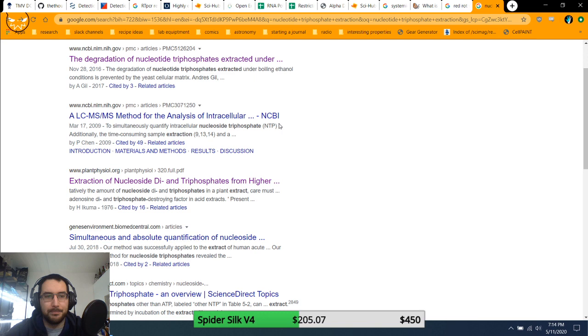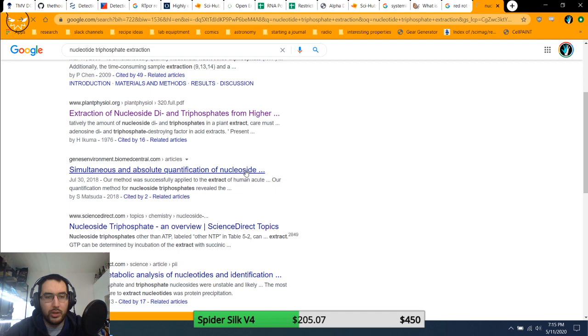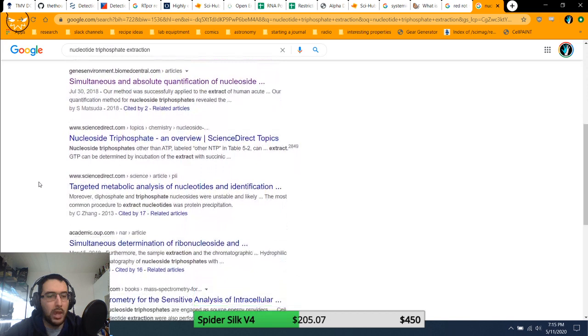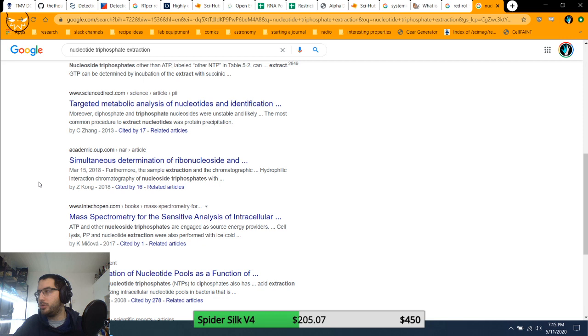Simultaneous and absolute quantification of nucleosides from human tissue? That's no good. Nope, don't want that. I just want something simple. It should just be a matter of popping the cells open. I don't need pure nucleosides. Okay, well, either way, I think I've got a game plan.